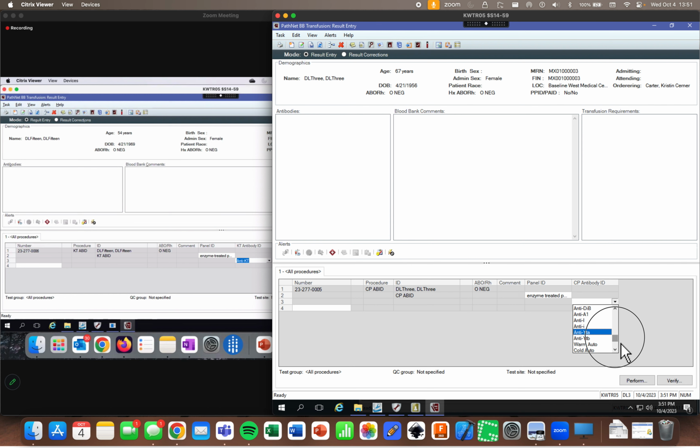That code set's a little bit odd, and it usually puts it in code value order, so the new ones go down at the bottom. I don't know why that one's different from some of the others. I think you can force sequence it in either the sequencing tool or in Core Code Builder.